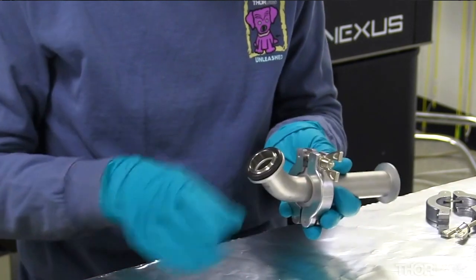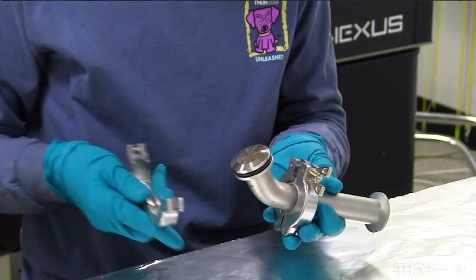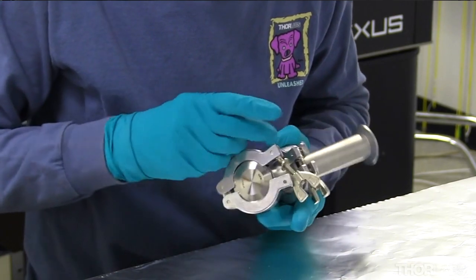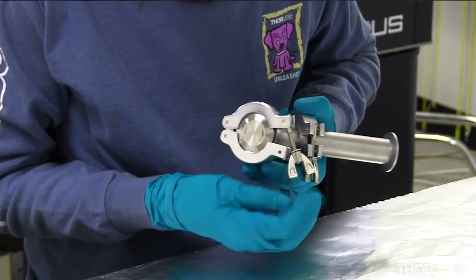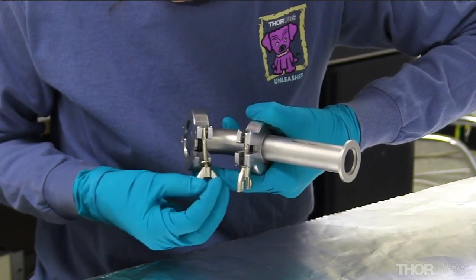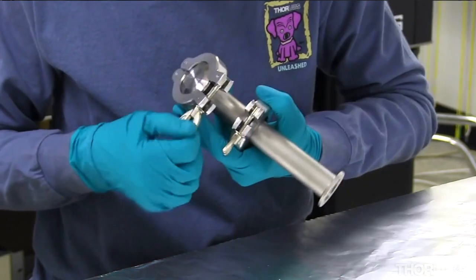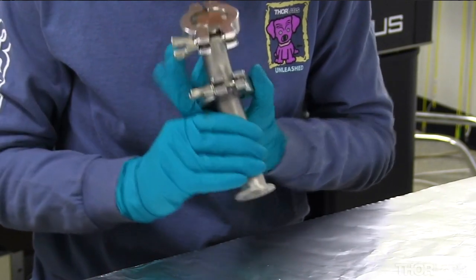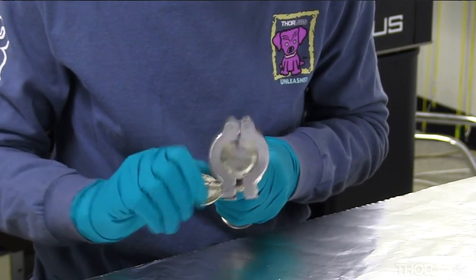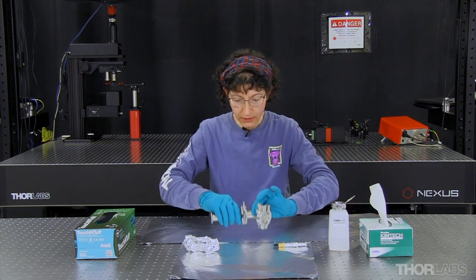Now I'll put the blank on and tighten the clamp as I did before. Swing the wing nut over, loosen, slide it into the groove, then begin to tighten. It feels nice and tight, and this is our assembled vacuum assembly.